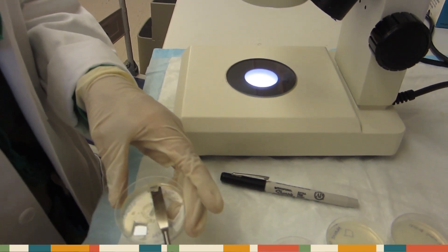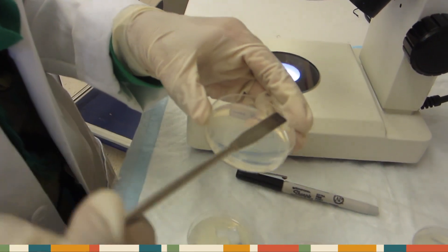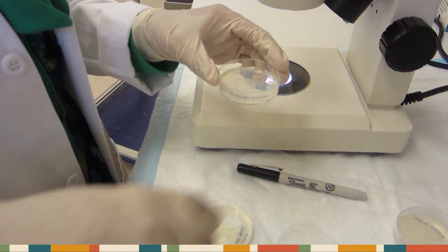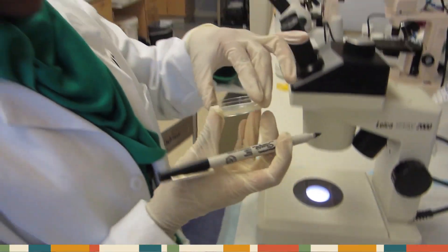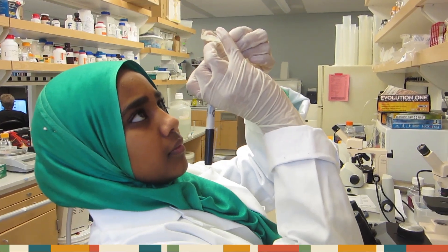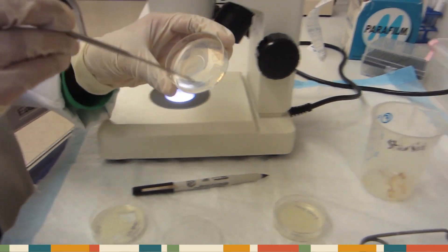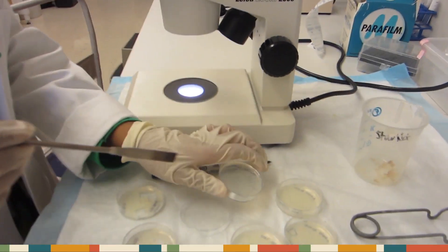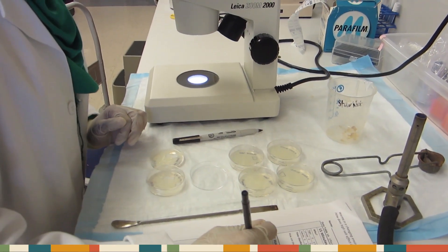Scoop up the pieces, and place them worm-side down on the rim of your low-salt and high-salt plates. Remember to outline the drop site. Also, after each plate, record the time.